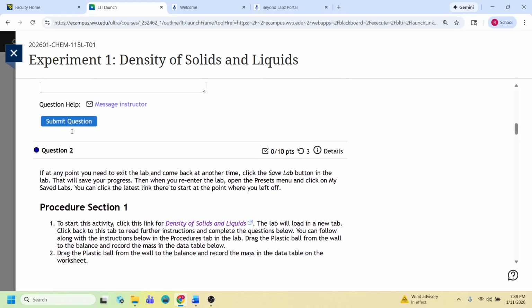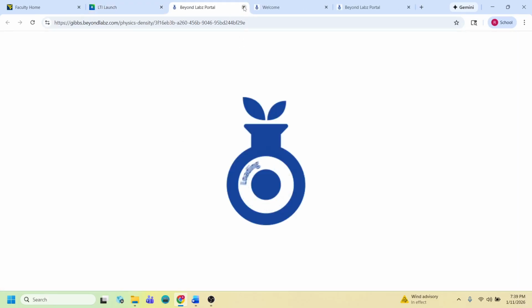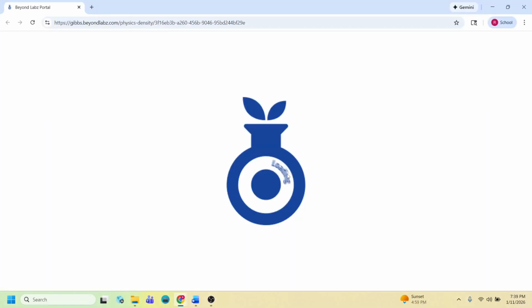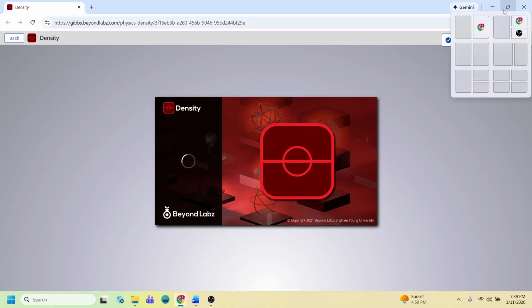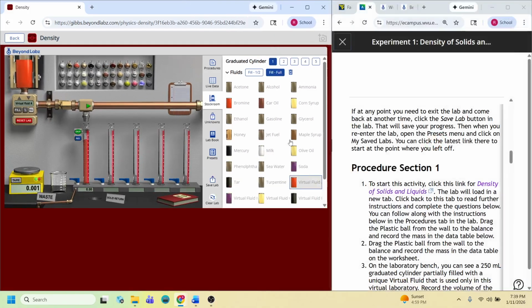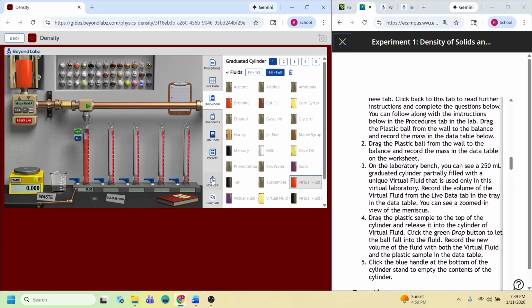And then, so this is a pre-lab, I believe. And then you do have your procedure now. Under the procedure, this is your actual experiment. I normally prefer to open this in a new window, so that this is your actual experiment. Here you go. And I would prefer as well to put the procedure and the experiment side by side, with more space toward the actual experiment. Perfect. So here you go, so that I can scroll between the procedure and the actual experiment.